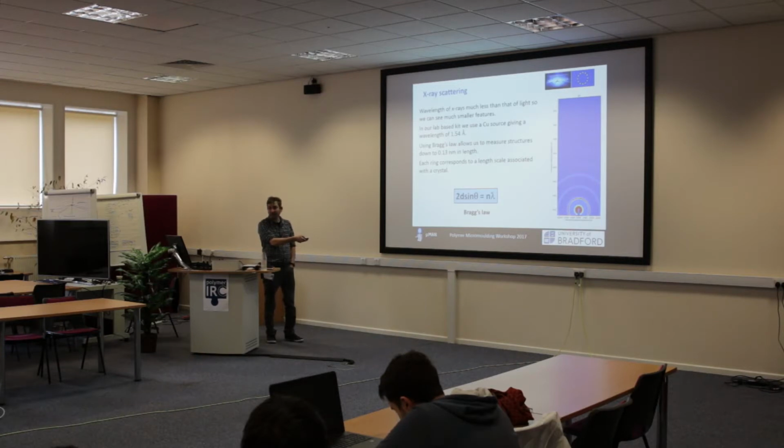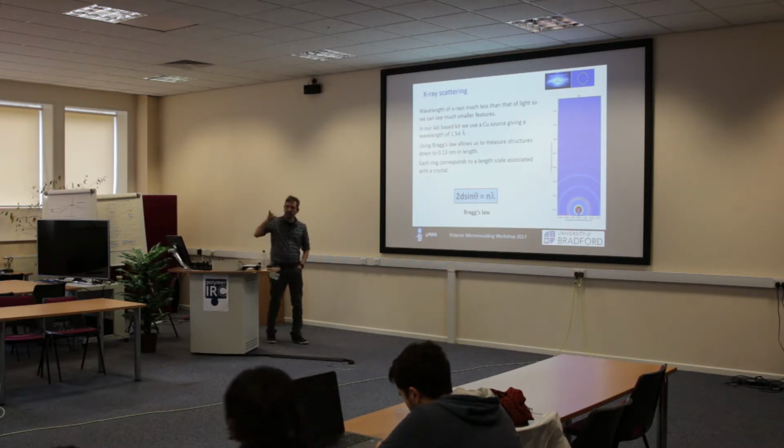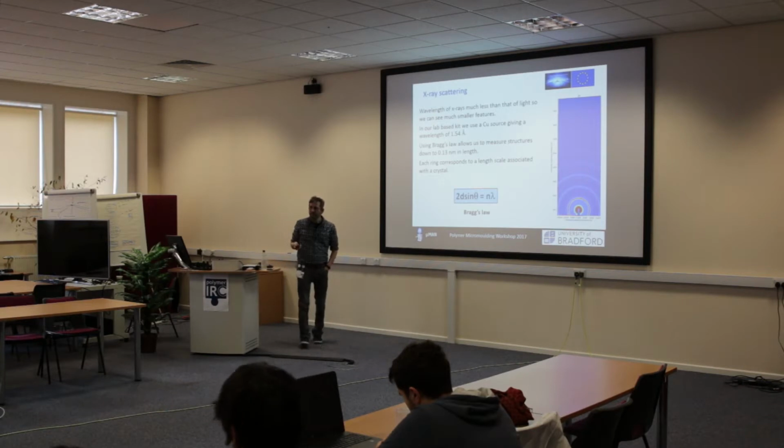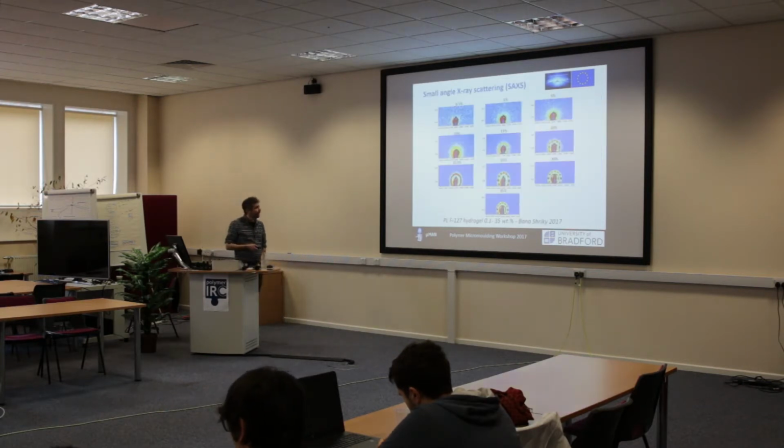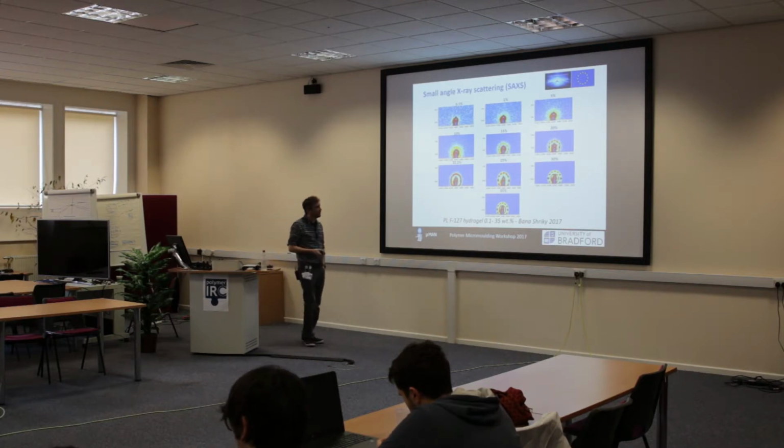Here are our large structures. These are around 10 nanometers. Out here, you're looking in the angstrom range. So you need to twist your thinking to be reciprocal space to understand scattering. But it's fairly simple. And here's some very brief results.